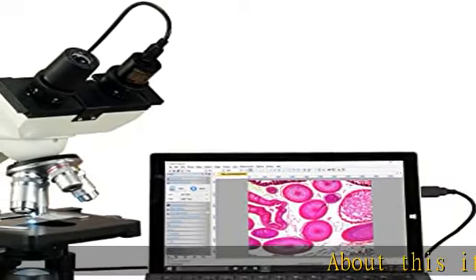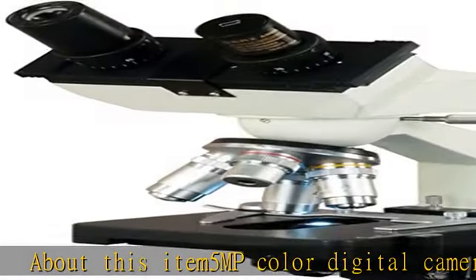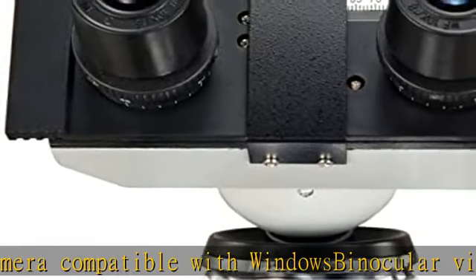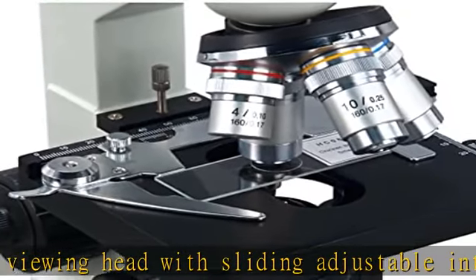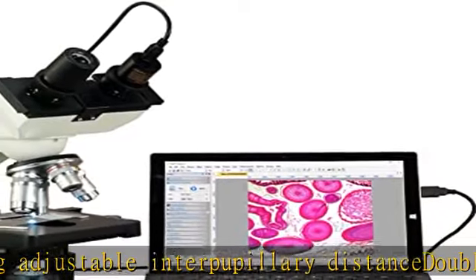About this item: 5MP color digital camera compatible with Windows. Binocular viewing head with sliding adjustable interpupillary distance. Double layer mechanical stage and coaxial coarse and fine focus knobs on both sides. A 1.25 NA condenser with iris diaphragm and filters. Variable intensity LED transmitted illumination. Check the description to get this product today at the best price.